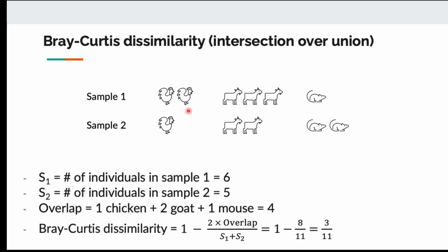So this concept that you can change from animal to bacteria is going to work out the same. Instead of the number of animals, you can think of this as a number of reads. You have different reads mapped to each organism in your data. So Bray-Curtis is very simple. Once you classify all the taxonomy, you just count how many reads you have mapping to different organisms. But Bray-Curtis is also very limited. Anything that's simple is going to be bad in certain circumstances.